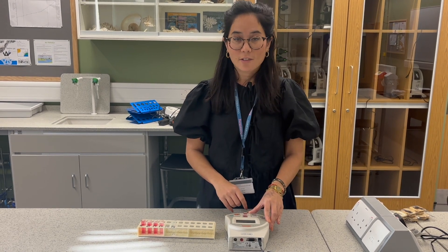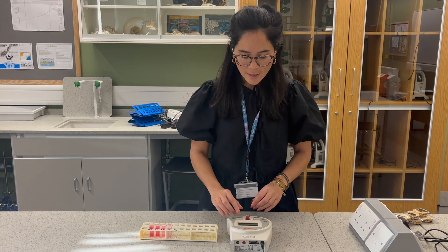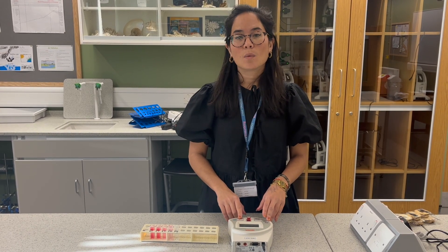My reading here is 0.13, and then for the beetroot that was in the highest temperature — just as a comparison — my reading here is much higher at 1.26.